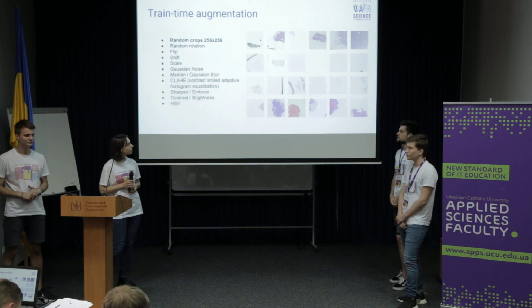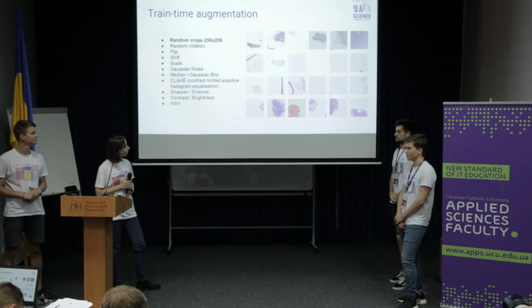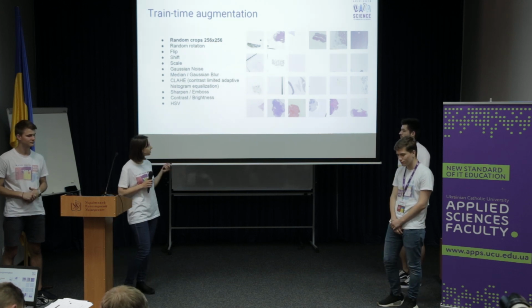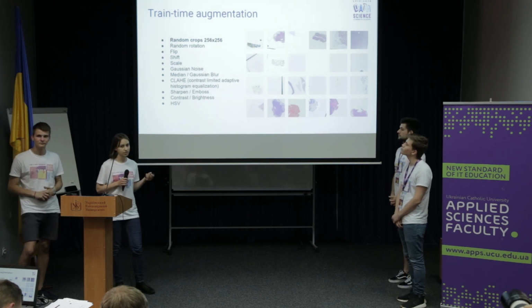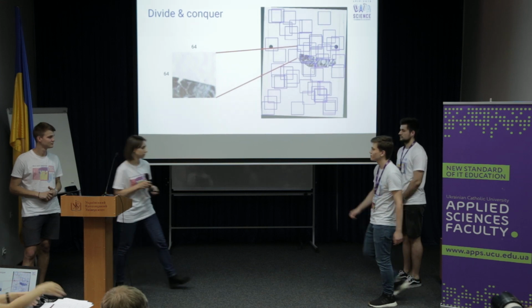As you can see, these transformations are really harsh, but the main idea is that the tissues are still distinguishable. Yes, about the second strategy, Dima will tell.